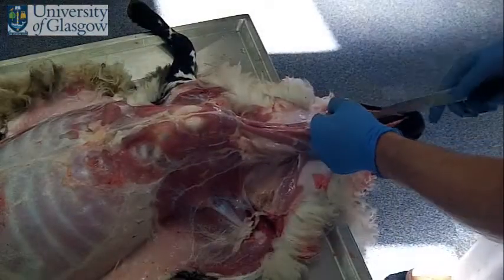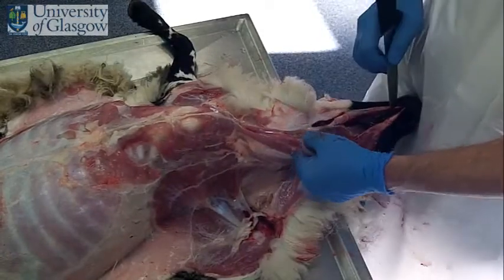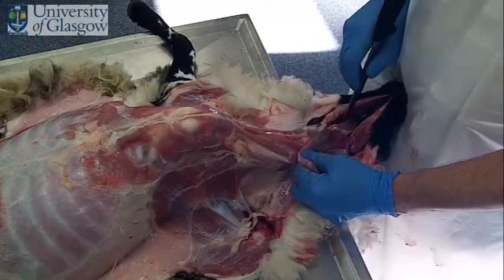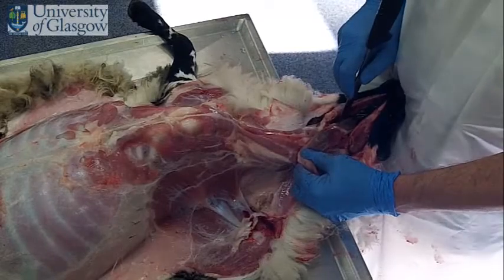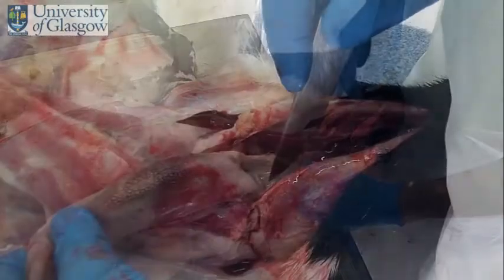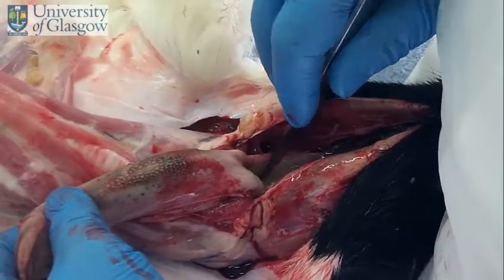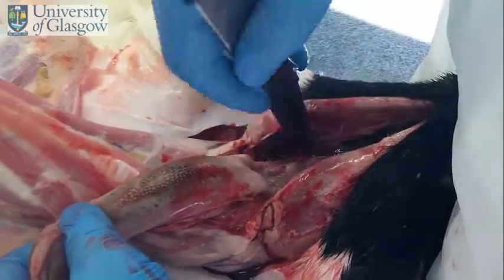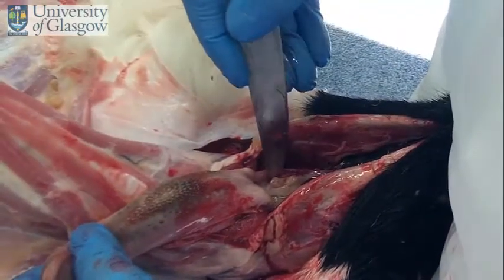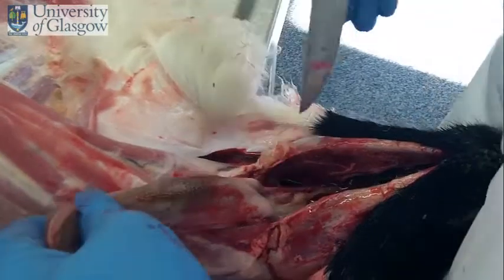If I pull this back here to the hyoid bone, we can see the tonsil. The tonsil in the sheep is a palatine tonsil, so it's not as obvious as it would be in a dog. But you can see the little flat area just in here, and on this side as well — that's your tonsils, just to identify. If I give it a cut, you can see the tissue just in there. These look perfectly normal.